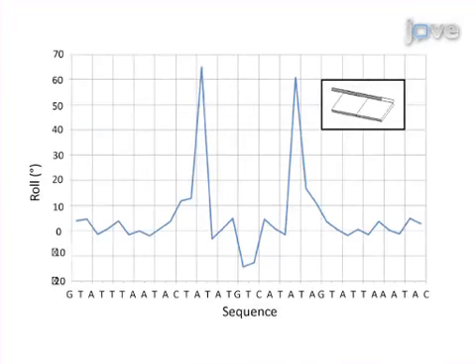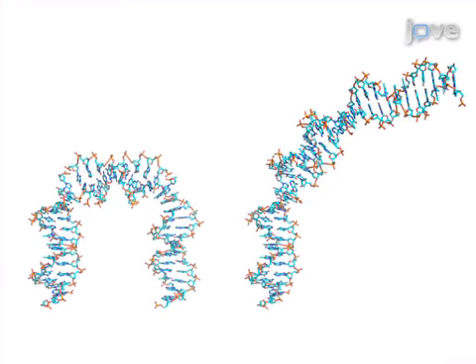The second step is to analyze a representative DNA structure at the level of the constituent base pair steps. Next, the same DNA structure is modified at the base pair step level and is then rebuilt using the newly defined base pair step parameters.